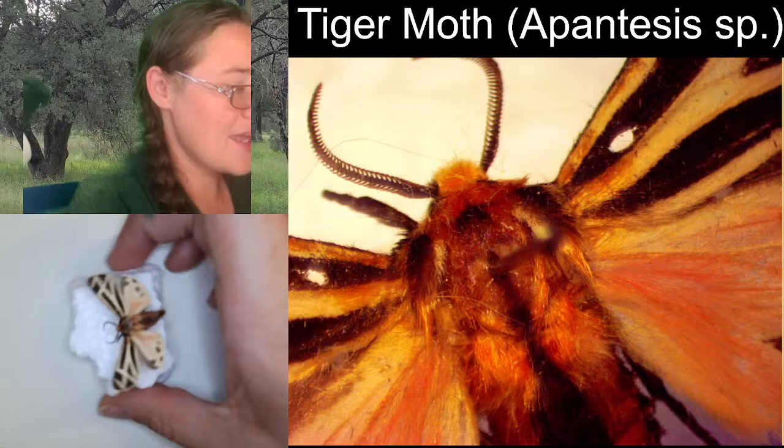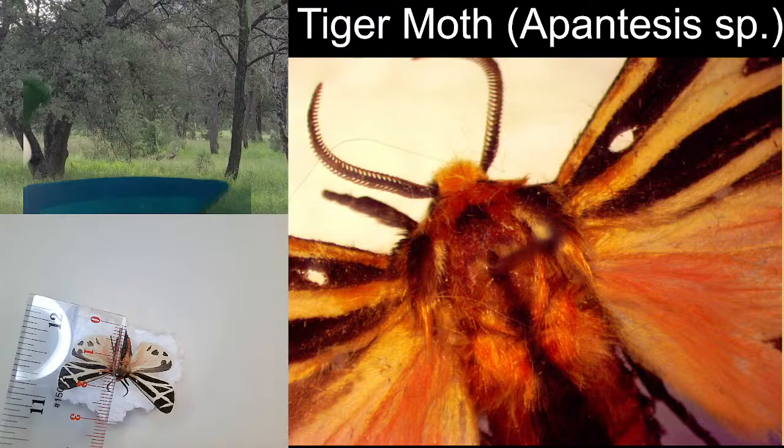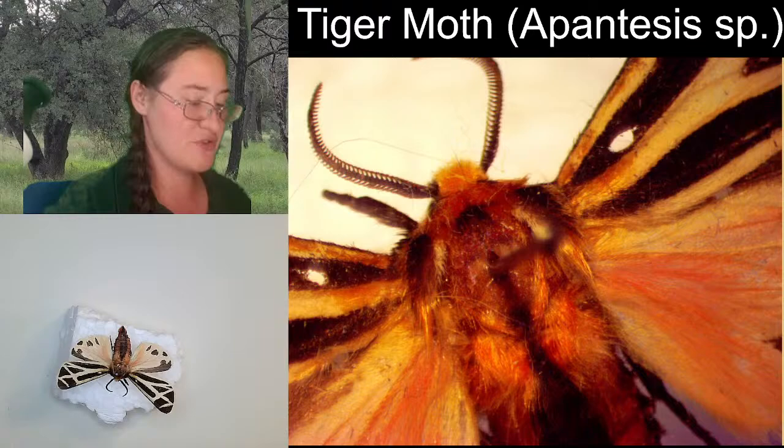And then if we go the body length, so from the end of the abdomen to the front of the head, not including the antenna, it looks like about 1.7 centimeters. So that gives you some measurements for your journals.